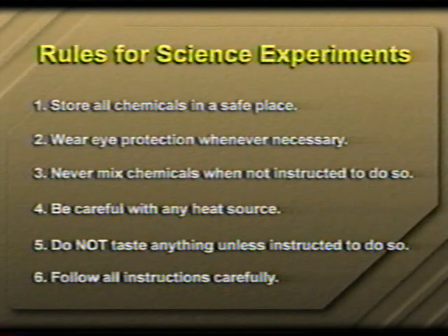Rules for science experiments. Store all chemicals in a safe place. Wear eye protection whenever necessary. Never mix chemicals when not instructed to do so. Be careful with any heat source. Do not taste anything unless instructed to do so. Follow all instructions carefully.